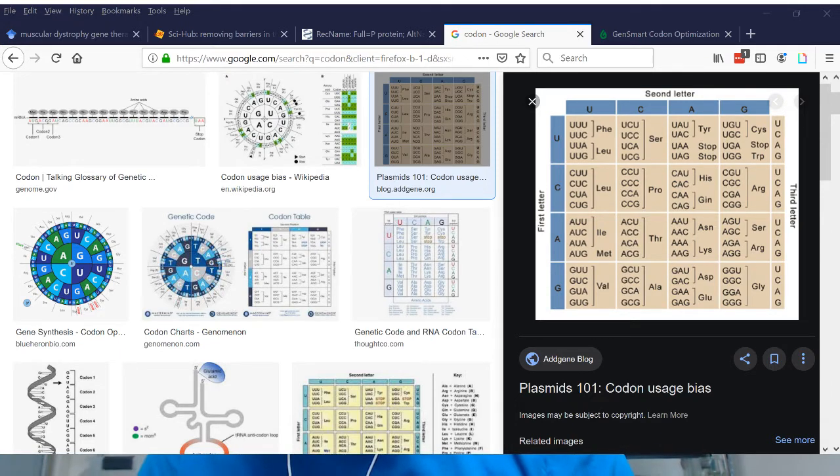If you have all the restriction enzymes, then you could basically use any MCS on any plasmid, right? So the next thing we need to do is find the MCS and what's there. All right, so we've got our CMV promoter, which causes the transcription of the gene, the T7 promoter, which is for bacteria, and then we have all these restriction enzyme sites.